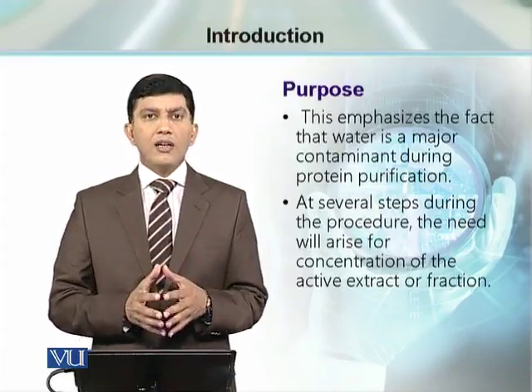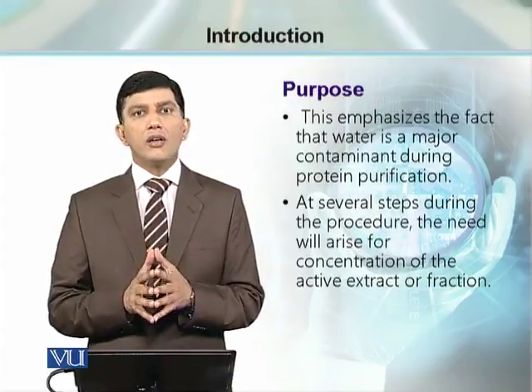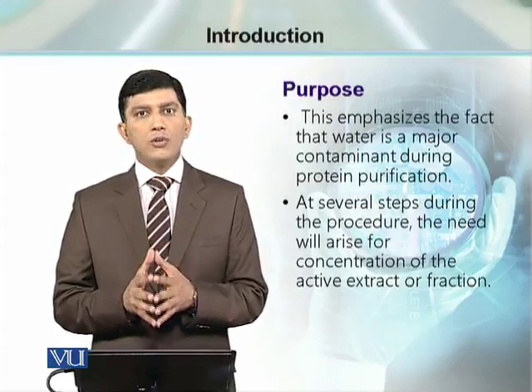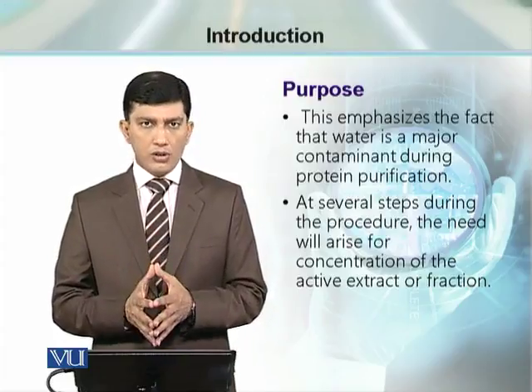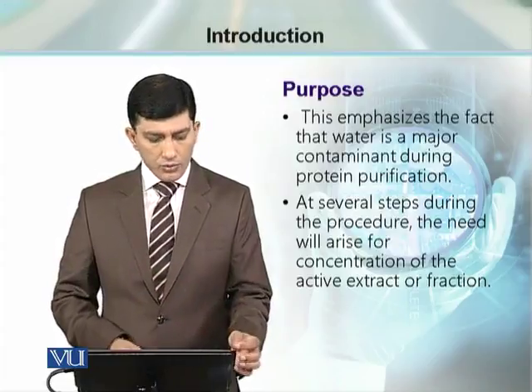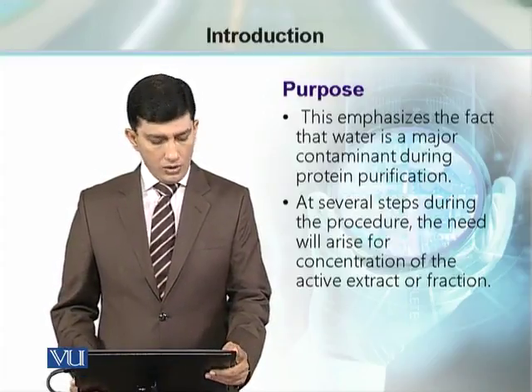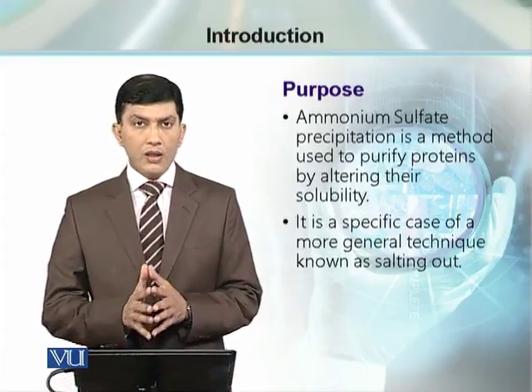अगर इस चीज़ को सामने रखा जाए तो हम कह सकते हैं कि जो वाटर है, इज़ मेजर कंटेमिनेंट ड्यूरिंग प्रोटीन आइसोलेशन. We may not need so much water in the protein isolation method, so we have to remove that particular unwanted volume of water.